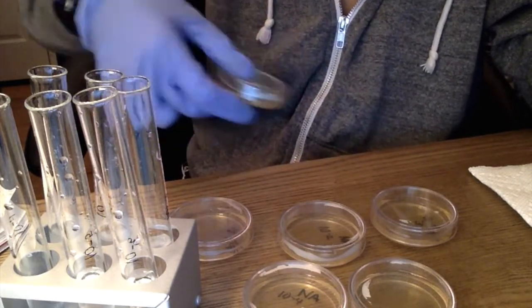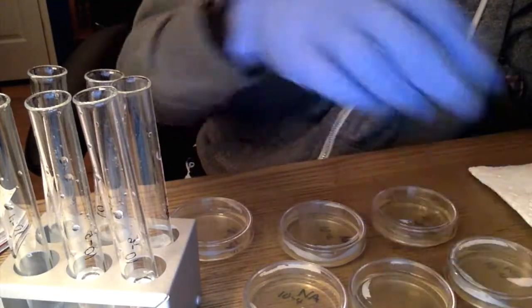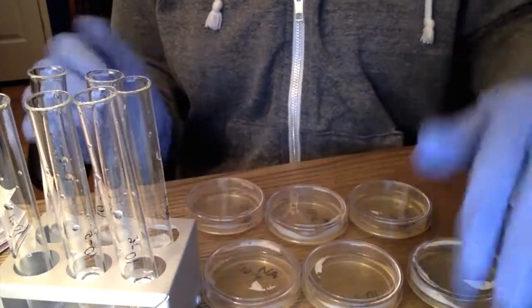And the point of this lab is to be able to see the difference, the exponential growth, in the ones that are less diluted and the ones that are more. And there we go.